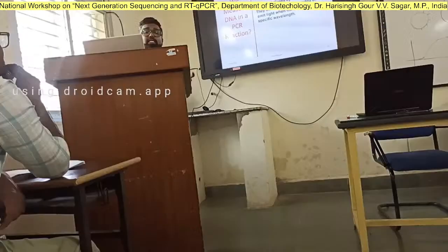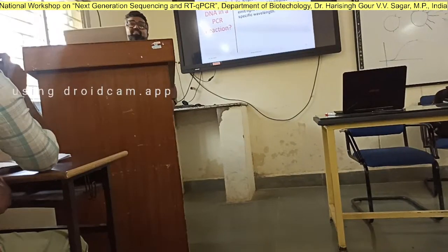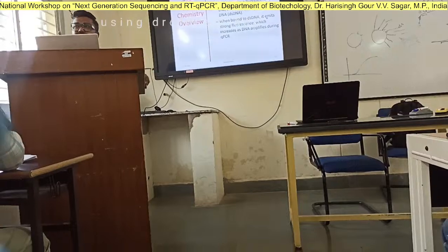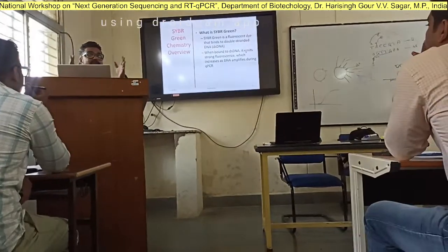Basically, it means if you have more amount of starting DNA, at every amplification cycle when there is double stranded DNA formation, more and more dye will bind. And then the signal will go off when you reach 90 because now DNA has become single stranded.